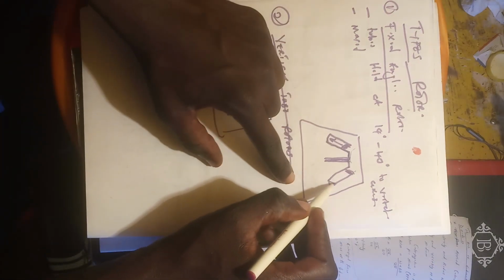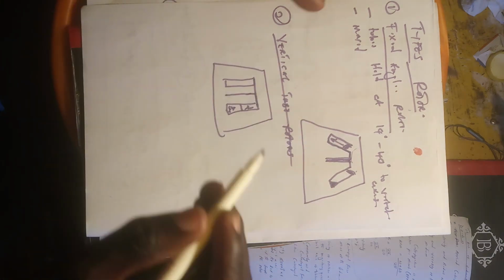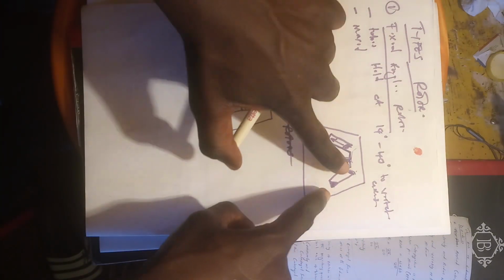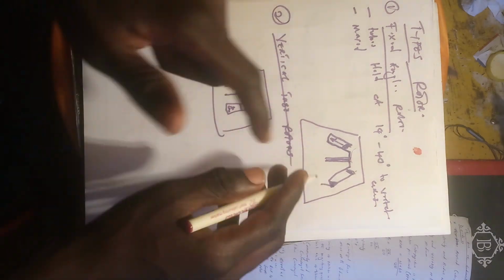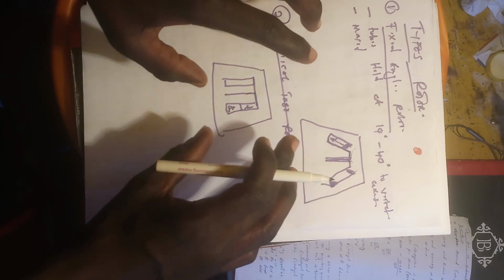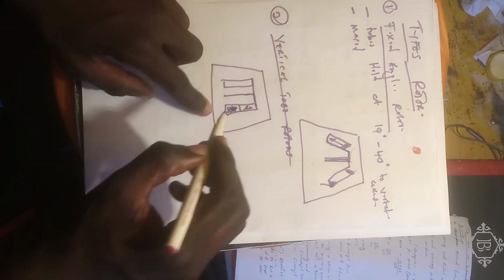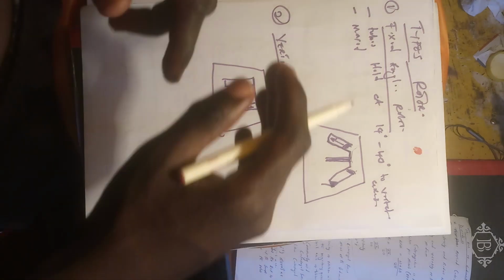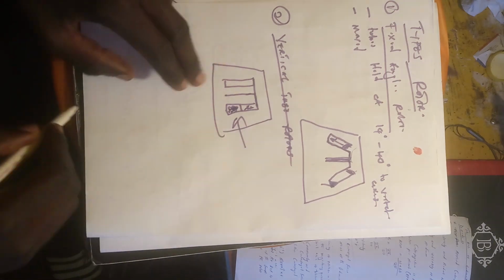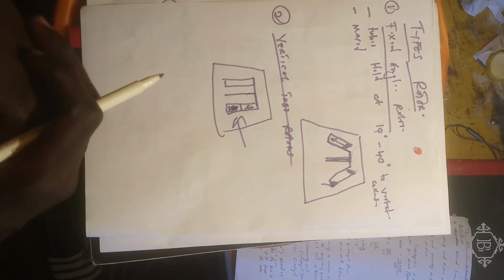Unlike in the fixed angle rotor, where you have the supernatant settling like that and the possibility of remixing is slim. But in vertical tube rotors, it is possible for the supernatant and the pellet to remix after stopping the centrifuge. So there are limitations, and it is not favorable to use this type of rotor.